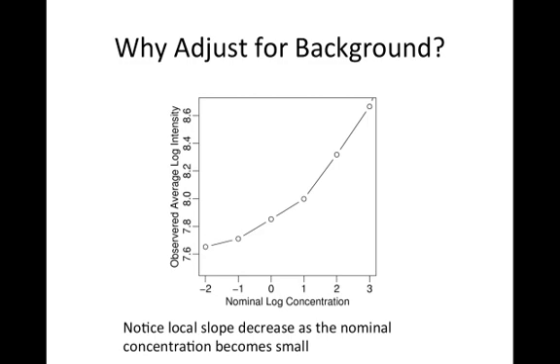So notice that if we were going to compare the array genes that were spiked in at a quarter compared to genes that were spiked in at a half, that should be a fold change of 2. However, we see that on average there is barely any change. It goes from 7.7 to 7.75.